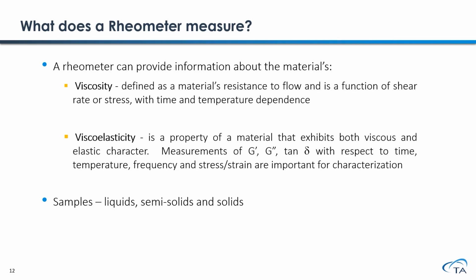A rotational rheometer can perform viscosity measurements as a function of time, temperature, shear rate, and shear stress. It can also perform oscillatory measurements and measure your sample's viscoelasticity, specifically reported as storage and loss modulus, tangent delta damping factor, and complex viscosity.